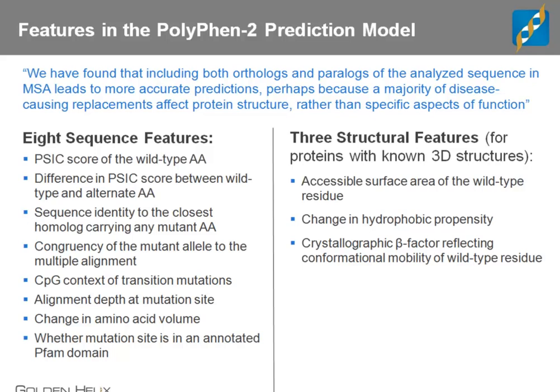And it's interesting to point out that in this statement, inherently, you can see that they are really interested in identifying disease-causing mutations rather than anything that simply has some phenotypic effect. You see throughout the literature that it's the variants that cause a structural change that are the ones most likely to lead to disease. So we won't go through all of the different features, but the lists are here, and you can see that they cover a pretty wide range of topics.